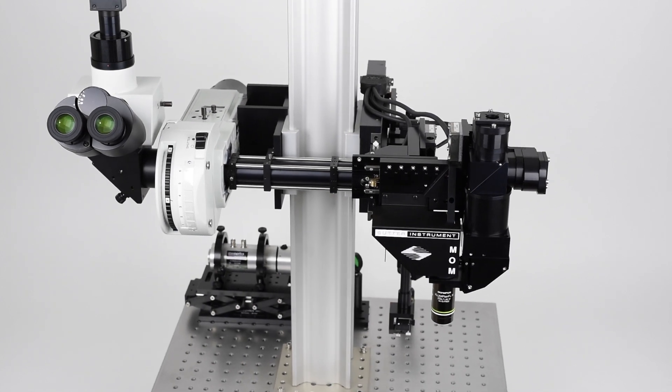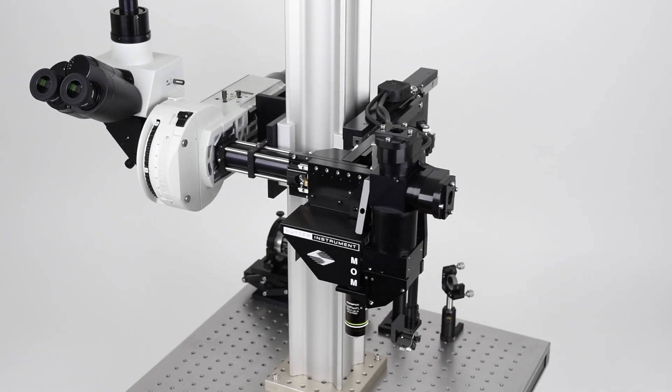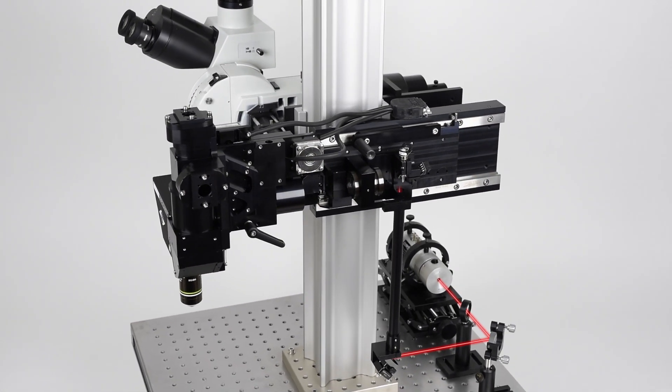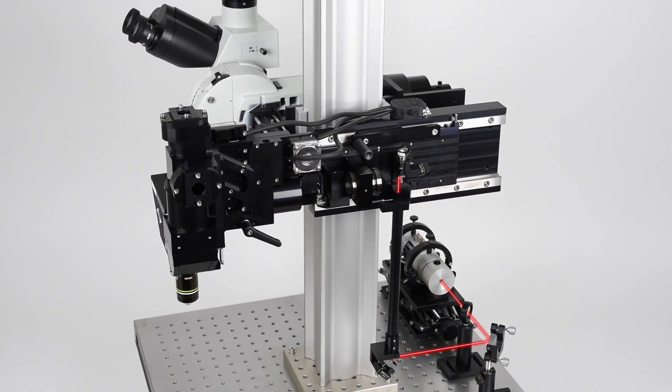The main imaging beam path for multi-photon microscopy on the Sutter MOM runs along the table, up through the periscope, and into the scanning mirrors. Then it is scanned by either resonant or galvanometric scanners through a scan lens and a tube lens before going to the head of the microscope.